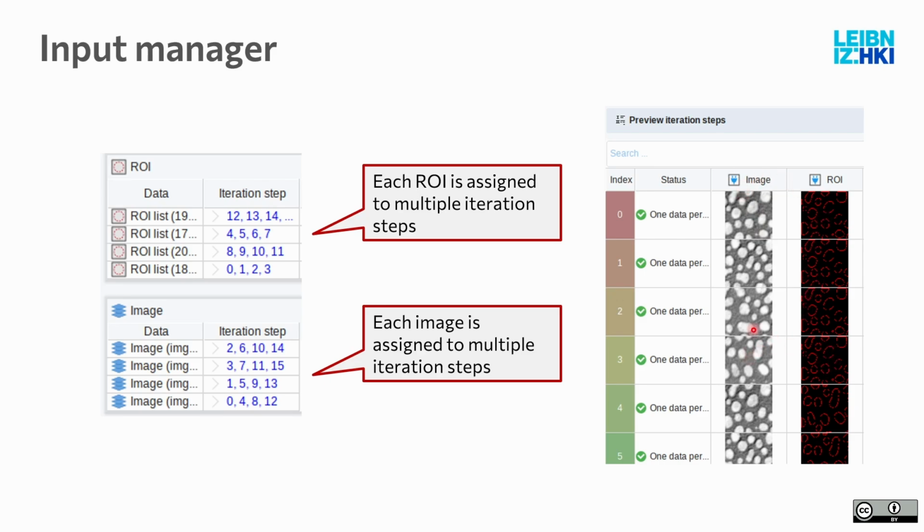So you have these ROIs wrongly matched with each other. And if you investigate this a bit, then you see, for example, this ROI here matches great, is the correct one, but then all of those, they match up wrongly. And why is that? Because you need to help JIPipe with the iteration. It needs more information from you.